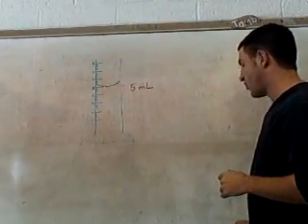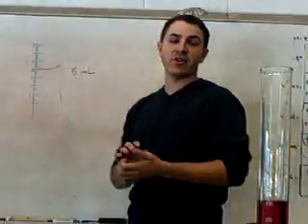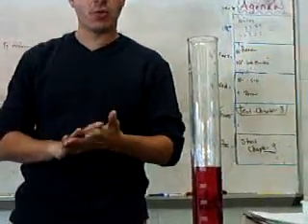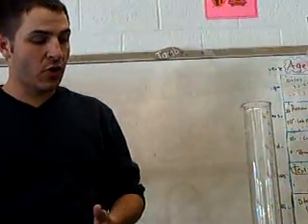We're going to look at our graduated cylinder. This is a large 1,000 milliliter graduated cylinder, and it still divides it up normally into milliliters for us.